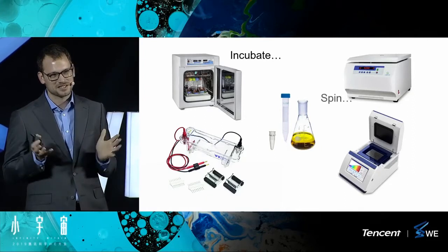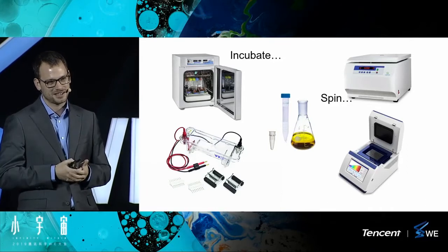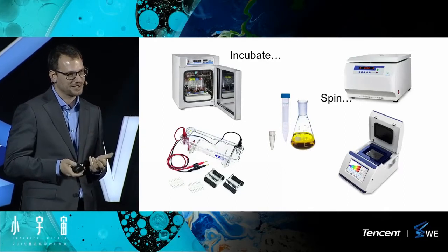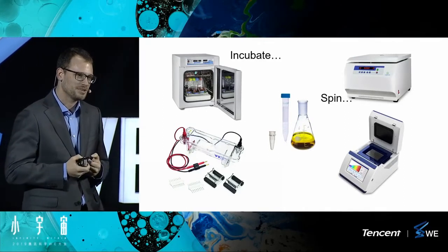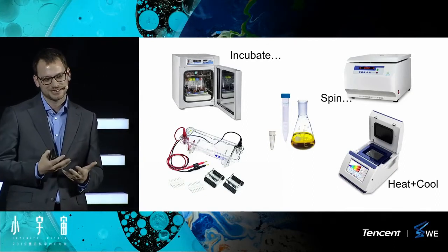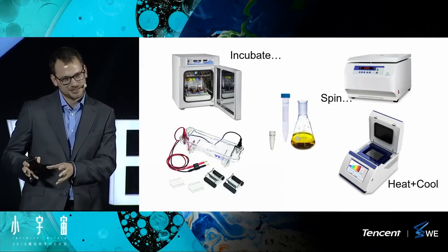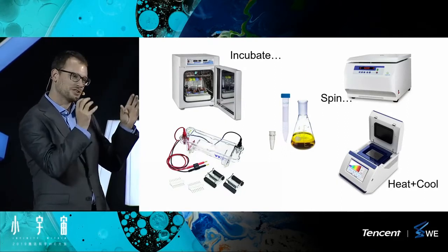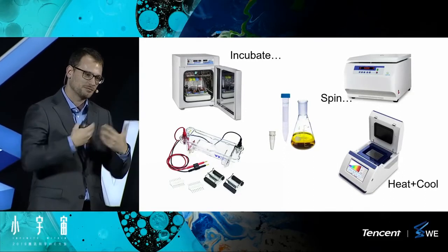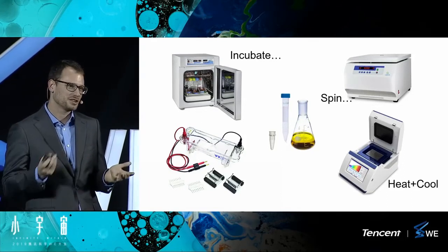Next guy, that's a centrifuge. Absolute key technique in, well, many sciences, allows you to separate samples by basically accelerating gravity, by spinning it. Here we've got a PCR machine that's basically a genetic material replication machine. The way it works is you've got a bunch of different enzymes that work at different temperatures, and you go through cycles of going to different temperatures that are optimal for these different enzymes, and that will facilitate the replication of genetic material. So basically, it's a glorified heating and cooling device.